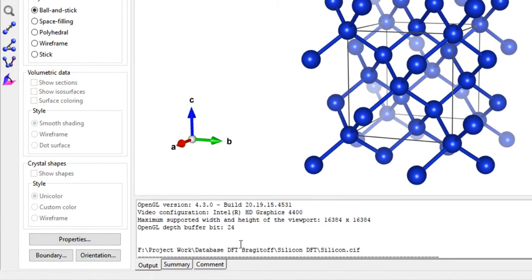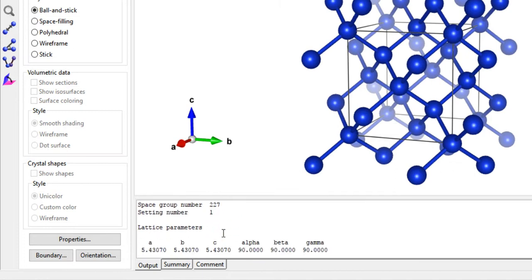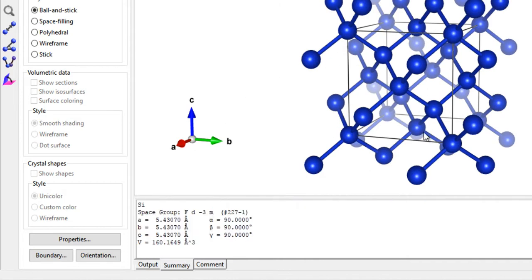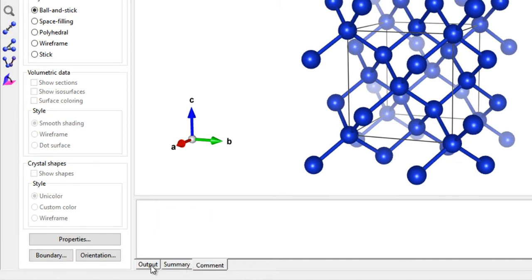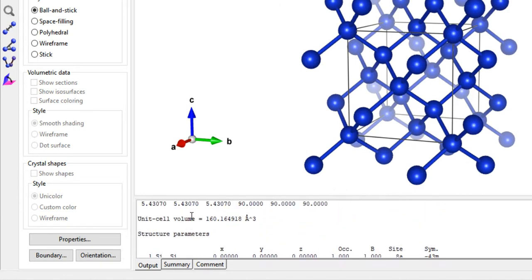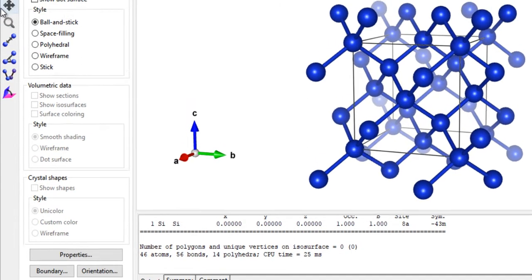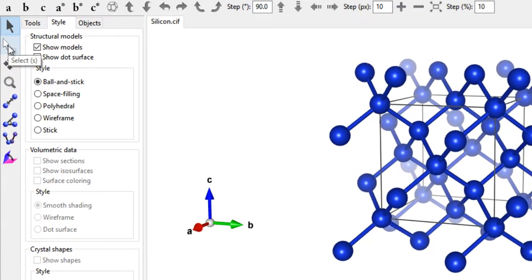The output screen at the bottom shows the programming output that VESTA is performing. For more useful information, click on the Summary tab to get all crystal information: lattice parameters, lattice angles, space group, and volume. You also have a Comment tab and an Output tab — whenever you perform an operation, this tab records the output and shows CPU time.